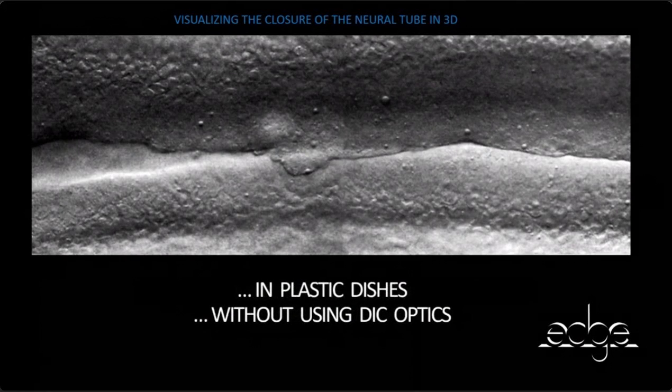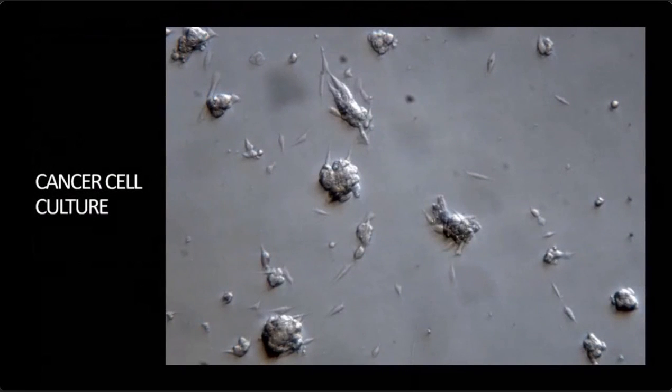And the great thing is it does this in plastic dishes. Now, a lot of you who look at live cells, you can't use Nomarski or DIC because the plastic dishes interfere with the polarization filters that exist in DIC optics. So this allows you to see a DIC-like image, but using it with plastic dishes. Here again in plastic dishes, this is just a culture of some cancer cells.